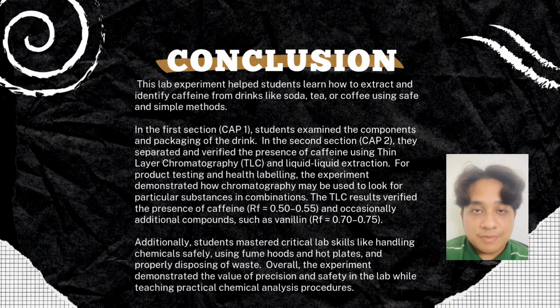Additionally, students mastered critical lab skills like handling chemicals safely, using fume hoods and hot plates, and properly disposing of waste. Overall, the experiment demonstrated the value of precision and safety in the lab while teaching practical chemical analysis procedures.